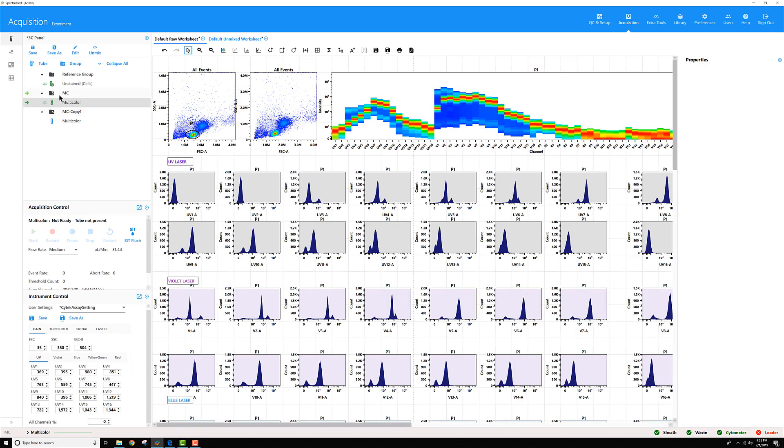Then the tubes under this MC group were all unmixed using one set of controls. And any tubes I record under this MCCopy1 group will be unmixed with the other set of controls with the lots that I specified.